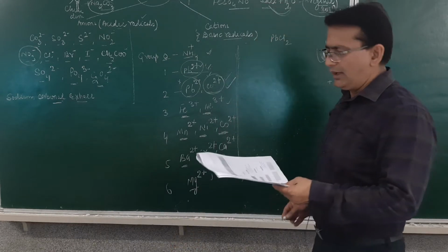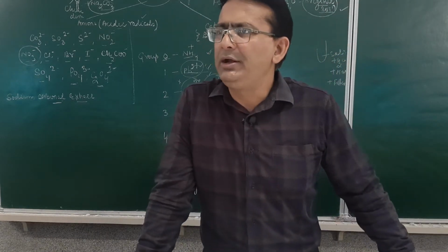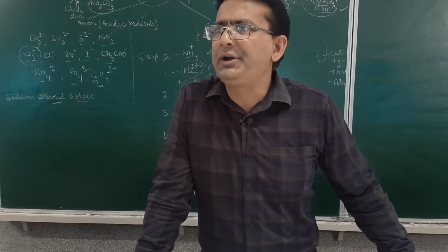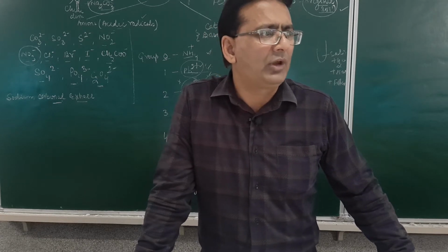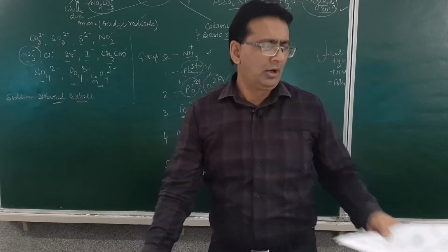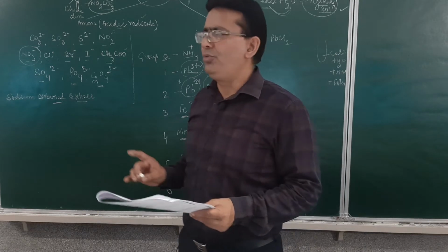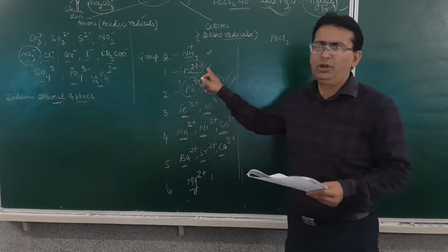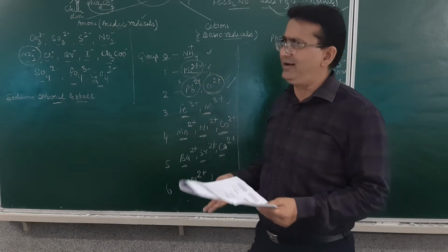Fine. Now, after the dilute HCl addition, if white precipitates are observed, it indicates the presence of group number 1. Then filter. The filtrate will be carried for the 2nd group. With the residue, we will carry out the test for the lead ion in group number 1. Am I getting clear? Now, after this, to the filtrate obtained, you pass H2S gas. Now, if the lead ion is obtained in the 1st group, there is no need to go for the 2nd group, because now in the syllabus we have only 1 cation and 1 anion.